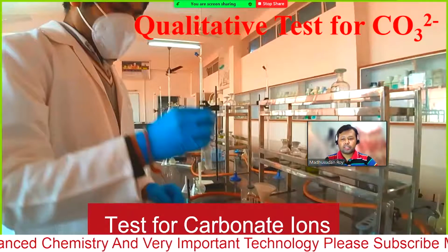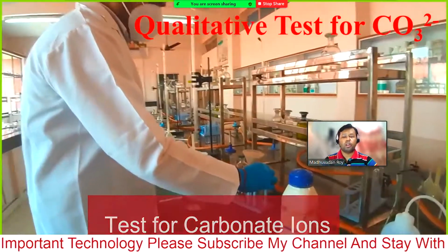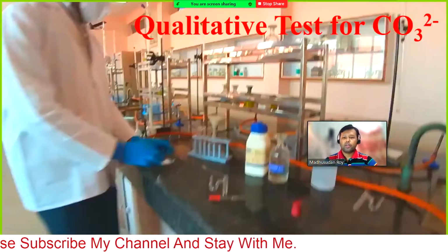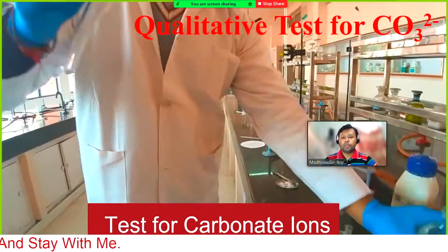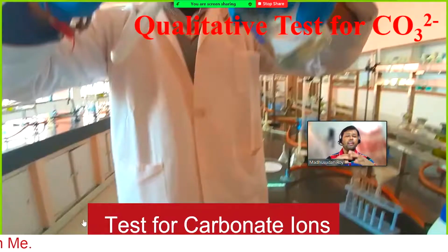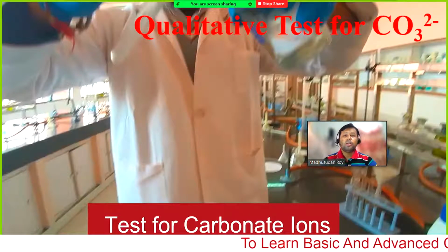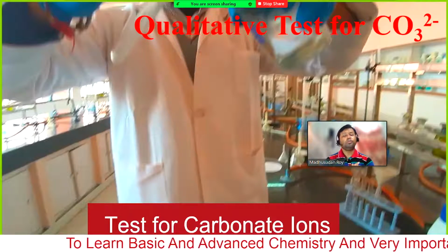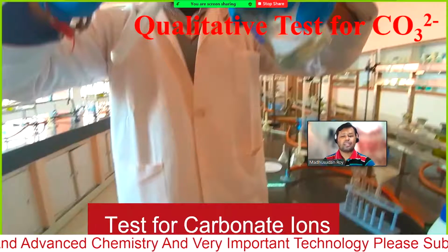You have to take a little more salt, and you need to prepare a system before the addition of the acid to the sample. You need to be ready before adding acid to the carbonate salt.